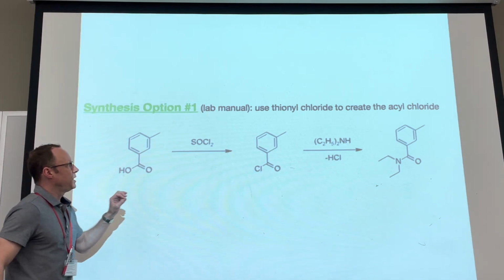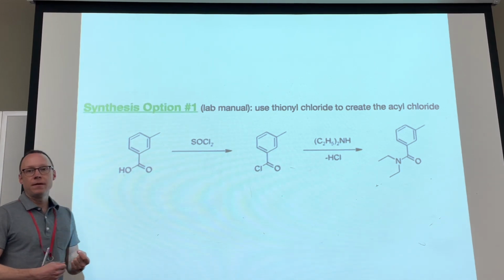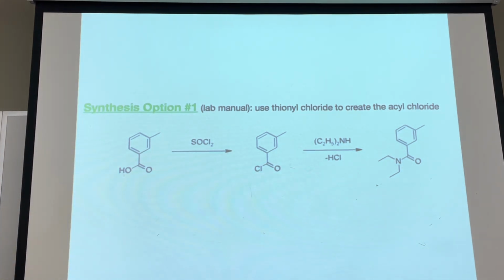You are going to ultimately be collecting your thionyl chloride, which is a liquid, in a syringe. I'm going to tell you something that you've probably never heard before, and if you work in healthcare, it is going to make you cringe. When you go and collect your thionyl chloride, about half a mil in your syringe, I would like for you to cap the syringe. I know you're never supposed to recap a syringe, but I would like for you to cap it. Number one, because as you draw up the thionyl chloride, if you just carry it back to your bench, it's going to start leaking out.